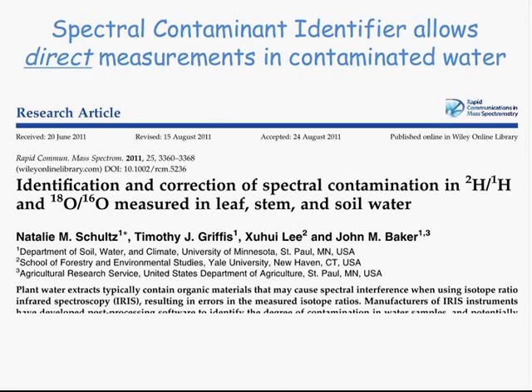Did you hear that? Yes, I'm trying to see if I remember the answer to the question. I believe it's approximately a minute to switch between them. It depends. There is some time in the instrument. I would need to know, is the question about switching between two vapor samples, or actually changing the isotope standard in the WVISS, changing the bottle to a different bottle?